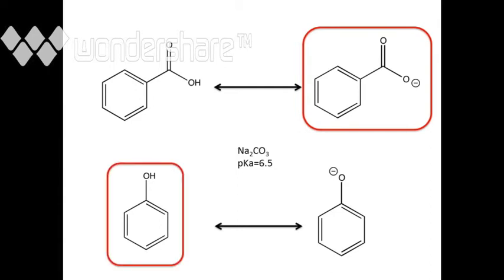Thus, the phenol will exist in the organic layer, seeing as it is still insoluble in the polar water, and the benzoate ion will exist in the aqueous layer, as it is an ion and will be soluble in water. This leaves the two compounds separated, and we can use a separatory funnel to separate them and then analyze.